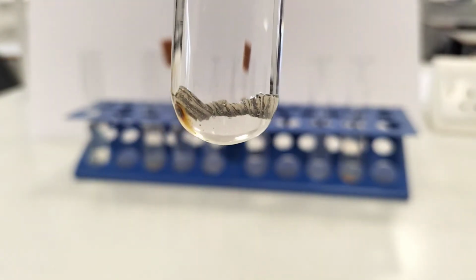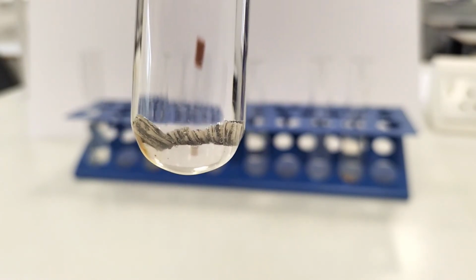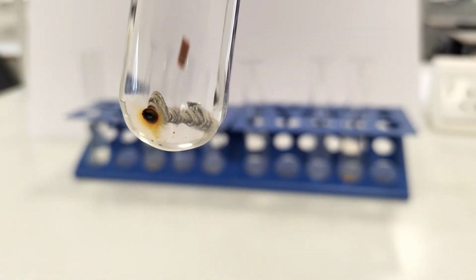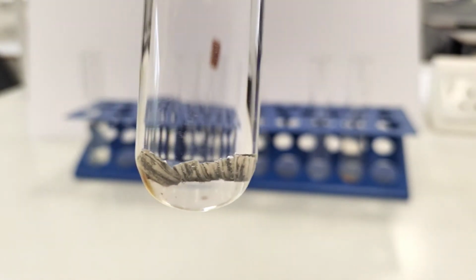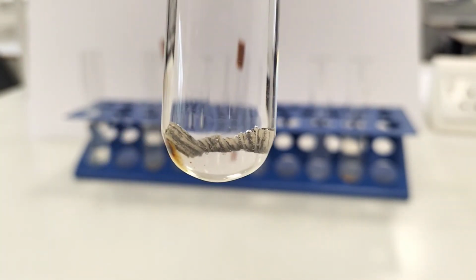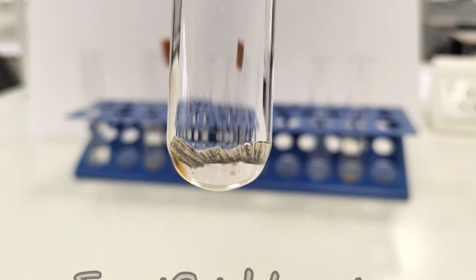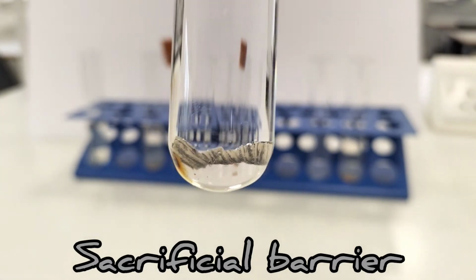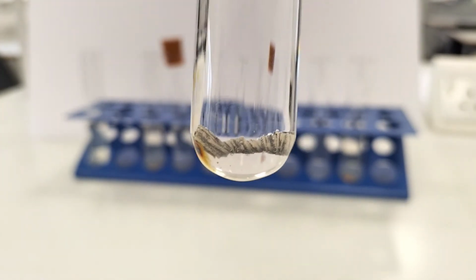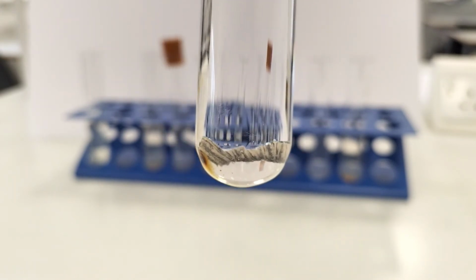Let's now move on to look at what our metals were doing in these experiments. In experiment 6, we wrapped a piece of magnesium metal around our iron nail. And it looks to be the case that most of the rusting has been prevented, except this end here. So how or why has the magnesium metal been protecting the iron nail? Well, it's all because magnesium is a more reactive metal than iron, and it's acting as a sacrificial barrier. The more reactive magnesium metal is reacting preferentially with oxygen atoms instead of the iron, and therefore protecting the iron from rusting.